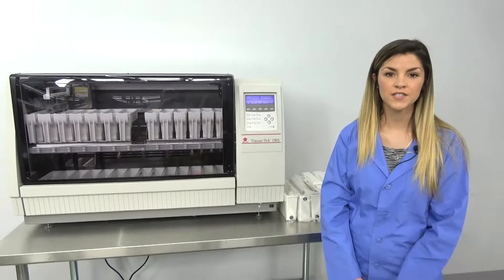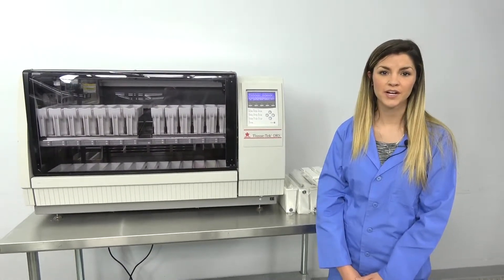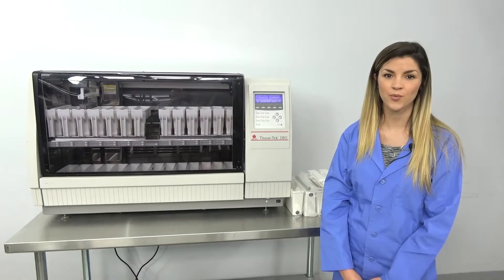This unit is located in our Cridersville facility. It has been evaluated by our technicians here and will come with a 90-day warranty.